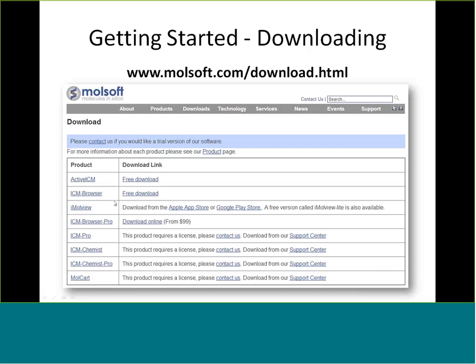And then there's iMolView. iMolView Lite is free from the Apple Store. iMolView, the full version, is 99 cents, but iMolView Lite is free, and iMolView is also free from the Google Play Store for Android devices. So you can download this from molsoft.com/download.html. Go here.